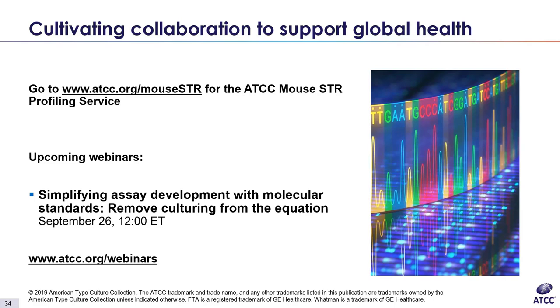All right, thank you, Balsam. This next one looks like a good one for Brian. Why is it that human STR profiling only uses 8 loci for cell authentication, but you need 18 for the mouse? All right, so that is a good one.